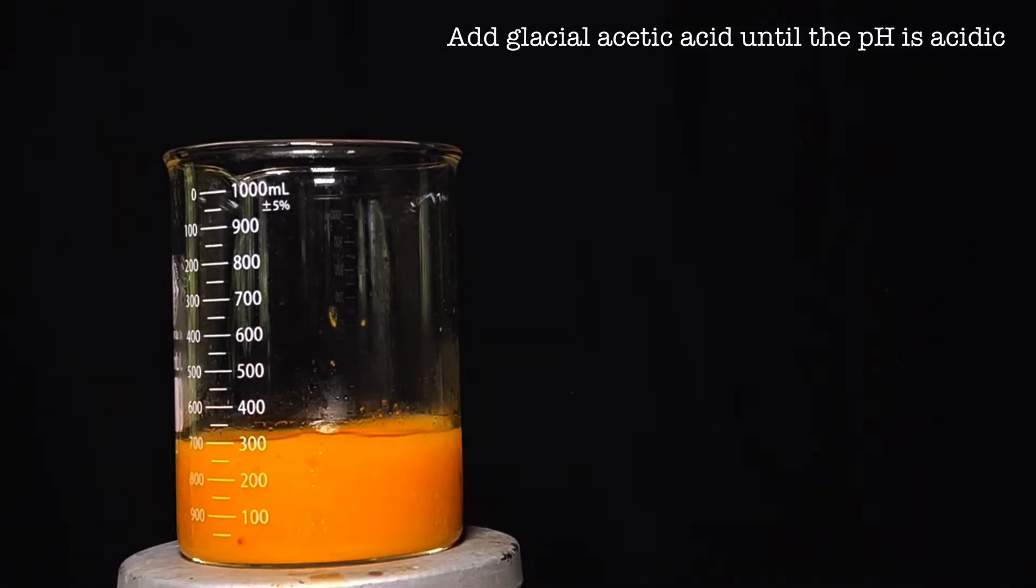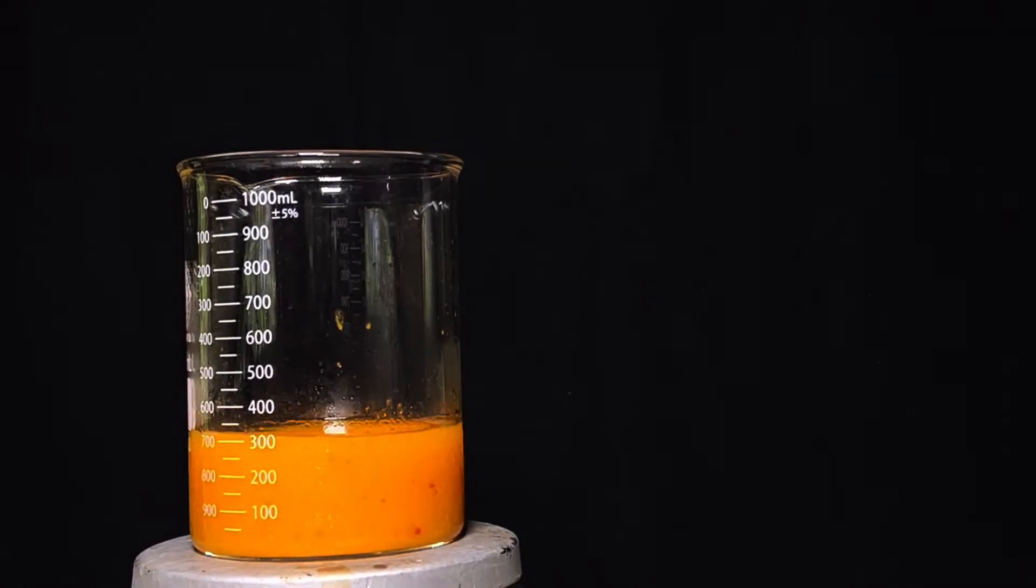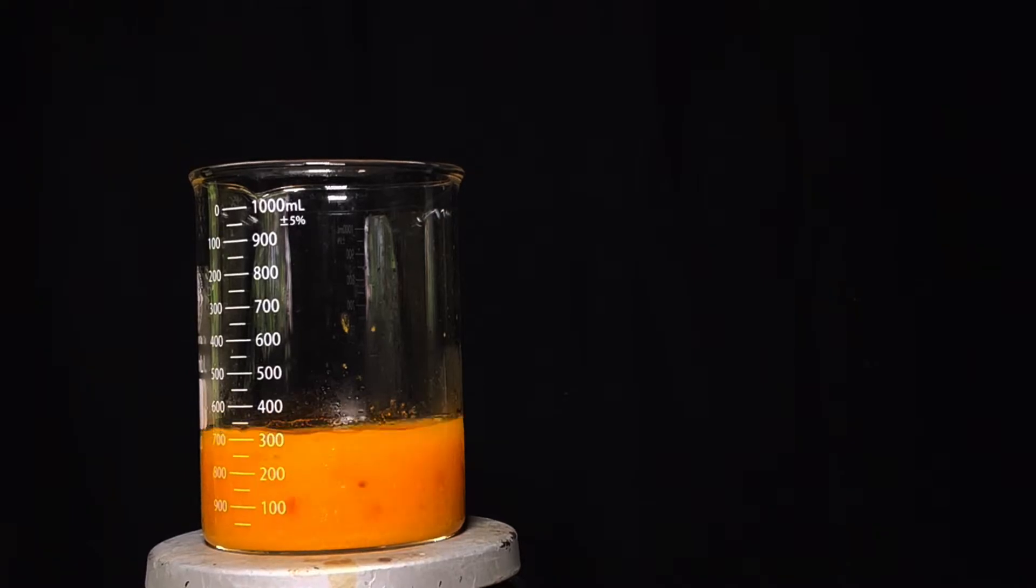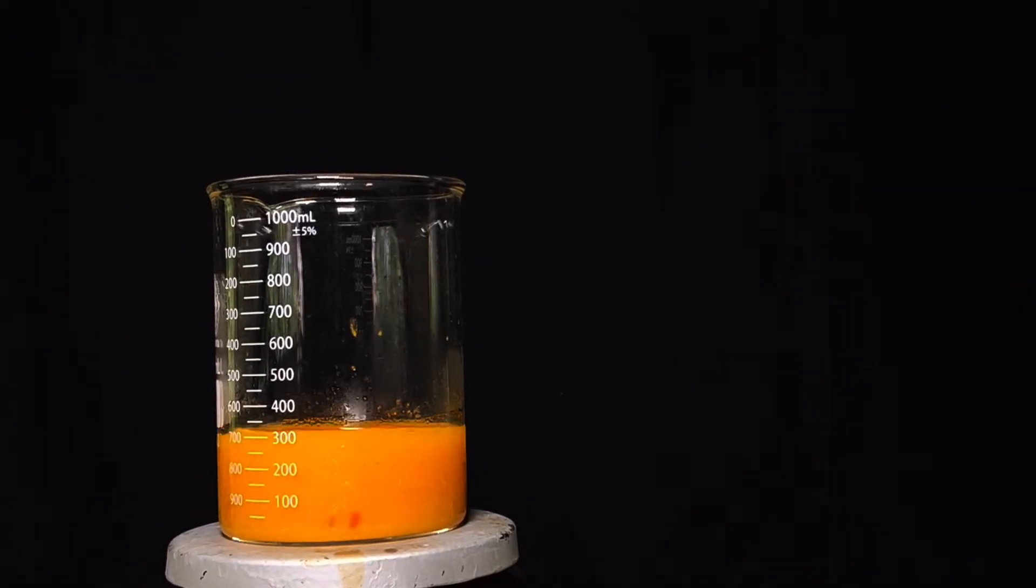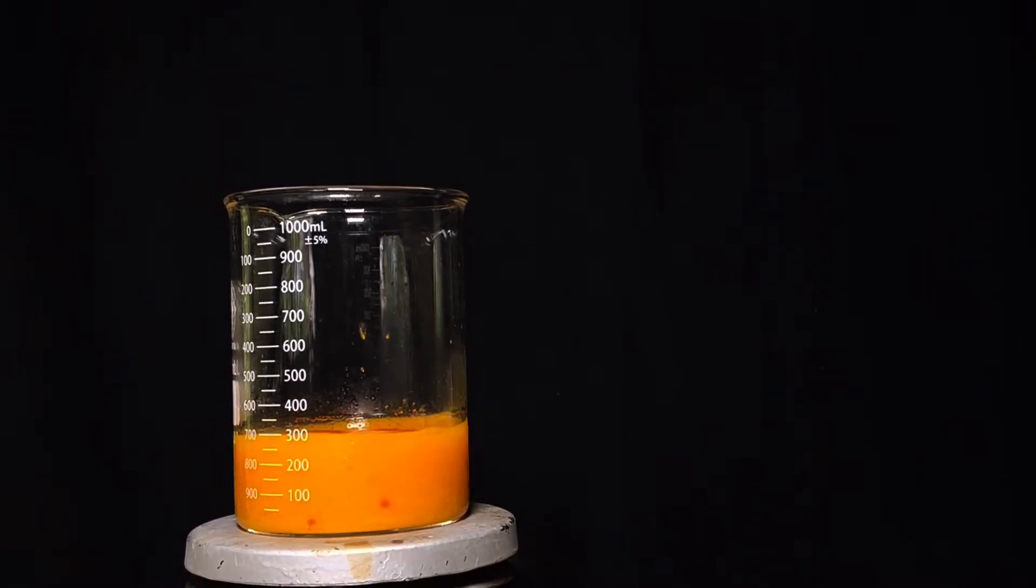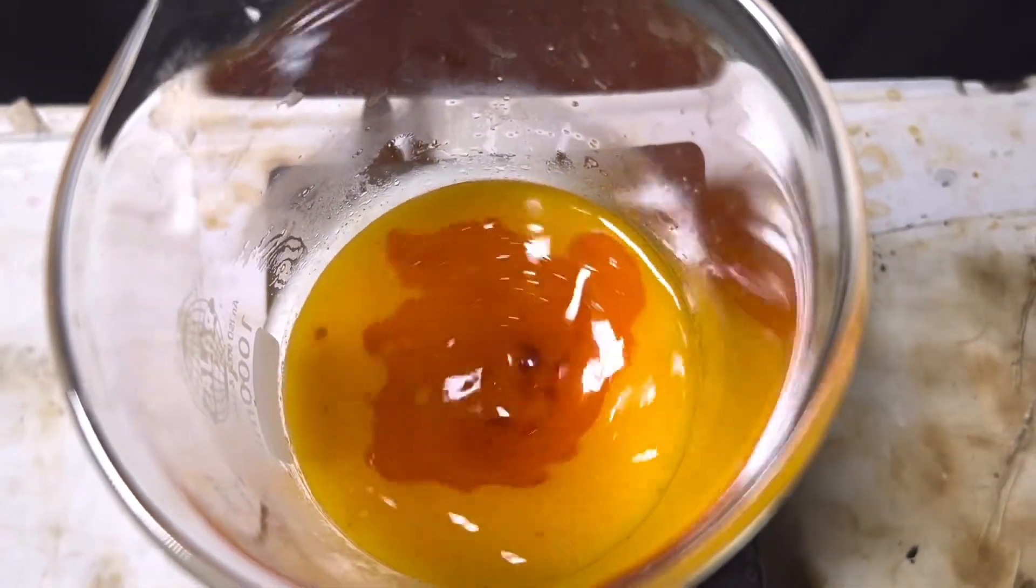Then glacial acetic acid was added until the pH of the solution becomes acidic. This was tested from time to time using a pH paper. After the solution becomes acidic, the color of the contents have transformed from bright yellow to orange. There is also some deep orange to red colored oily droplets floating around. And this is the crude azobenzene.